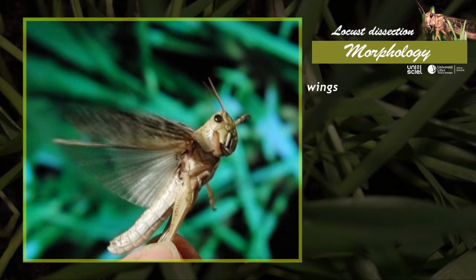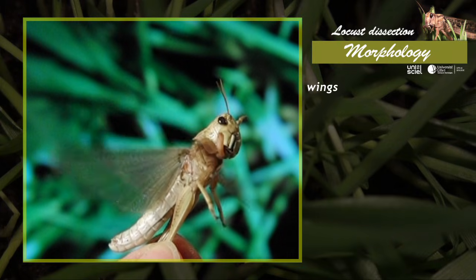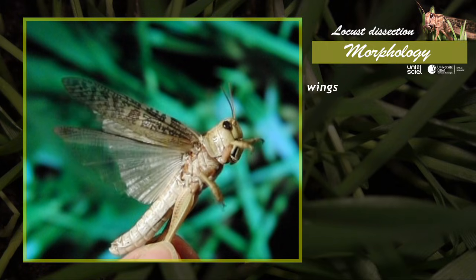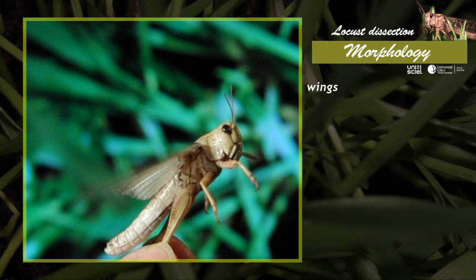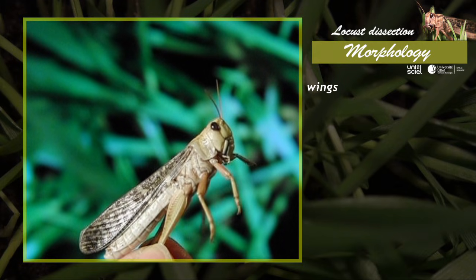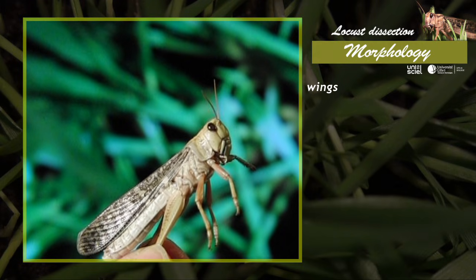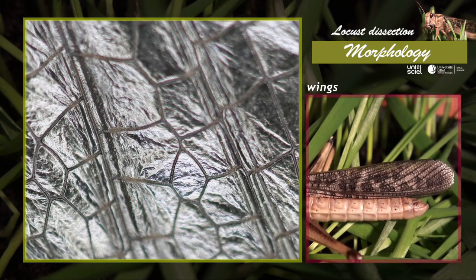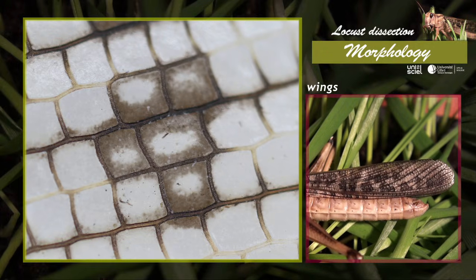During flight, the wings are held at right angles to the body. The tegmina are slightly raised so that the hind wings can flap. At rest, the tegmina cover and protect the folded hindwings. The structure of the wings is strengthened by thickened, tube-like veins.